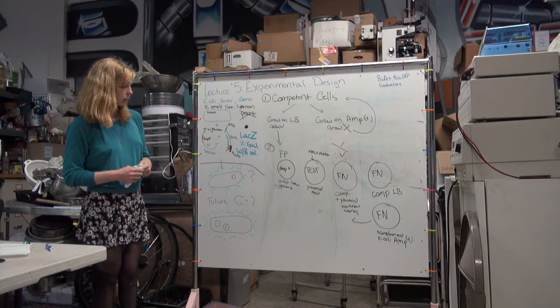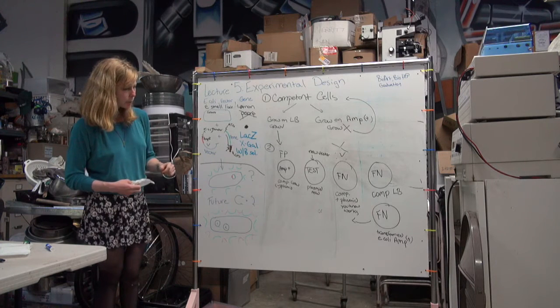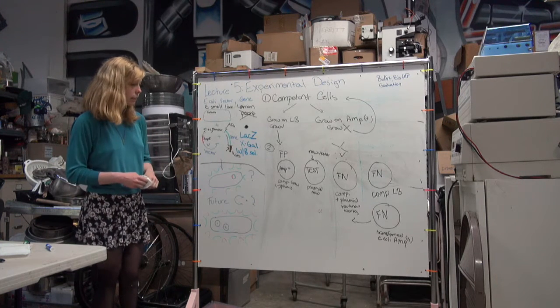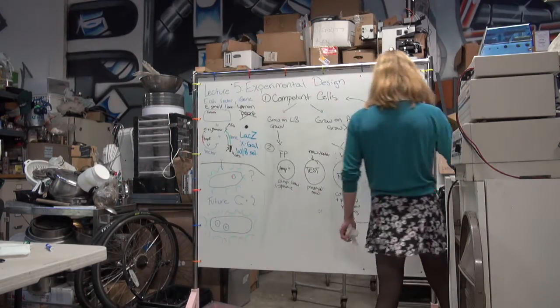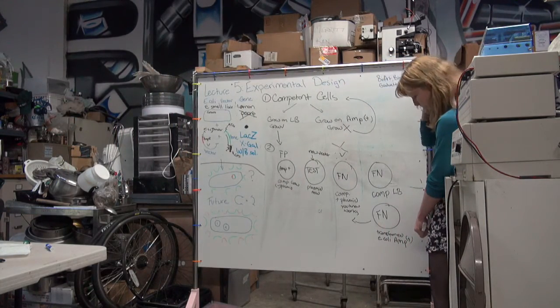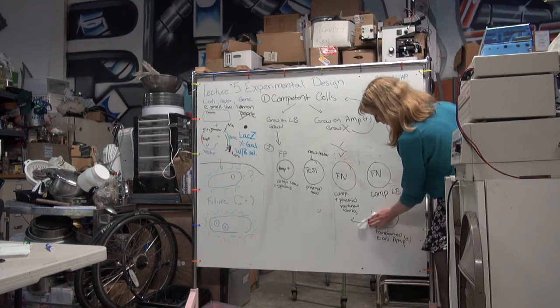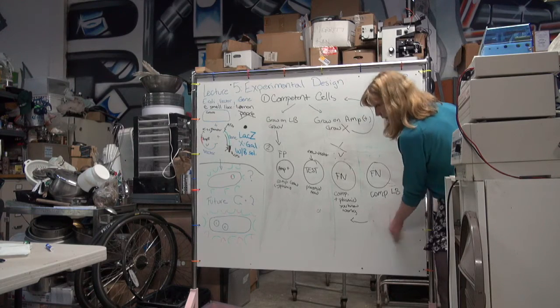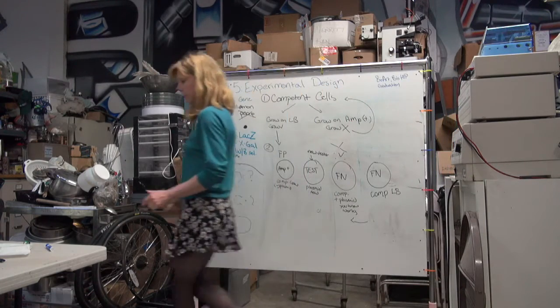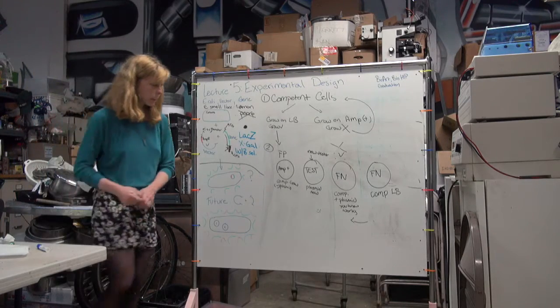All right, so when you do this next step, you do not have to, but you can make plates all at the same time to help control for not having to do every single control every single time. We're going to assume that we have enough ampicillin and it's not too much. But for our next step, we will still need this plate.